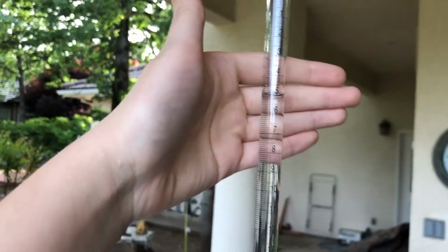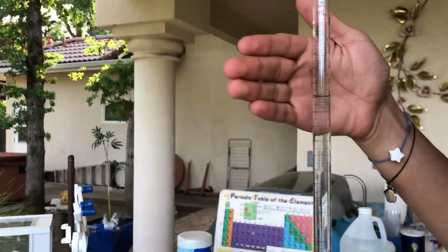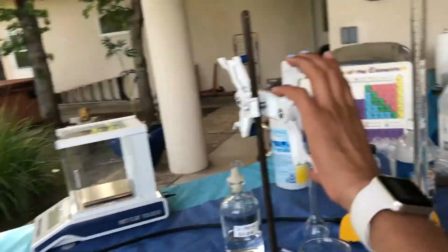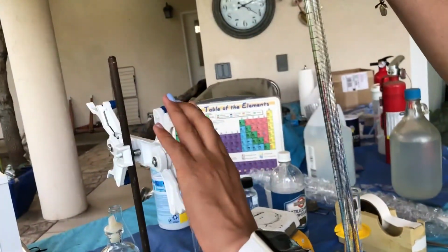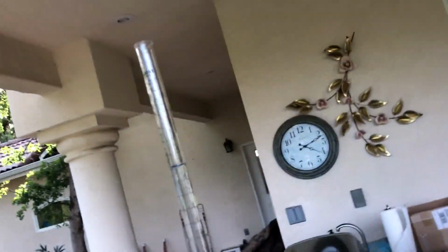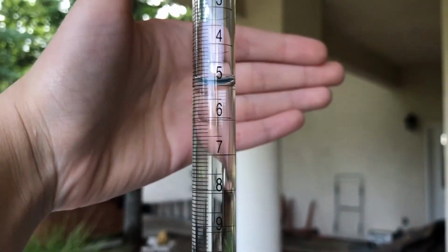5.0 or 5.10? You need 3 significant figures. Andre, can you see that? He's going to bring it down and look to see what the actual volume is. We need 3 significant figures. 5.01. Okay, so we're going to say our initial starting volume is 5.01 milliliters.